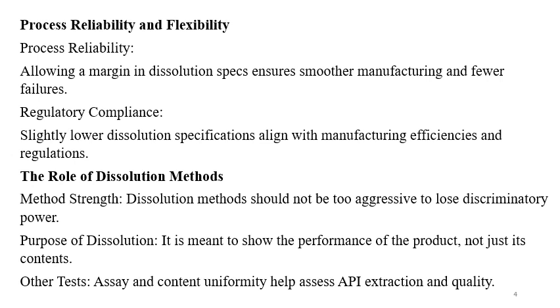Role of dissolution methods. So, what is the main role? First is method strength, second is purpose of dissolution and other tests. Method strength means the dissolution method should not be too aggressive, to avoid losing discriminatory power. If you are trying to achieve 100% dissolution and you are making the dissolution parameters unrealistic or bio-irrelevant, then it will become difficult.